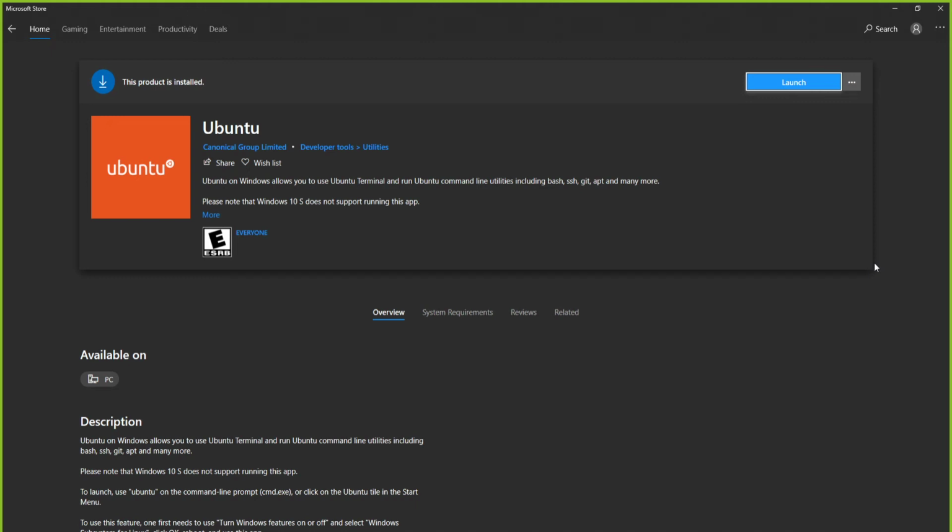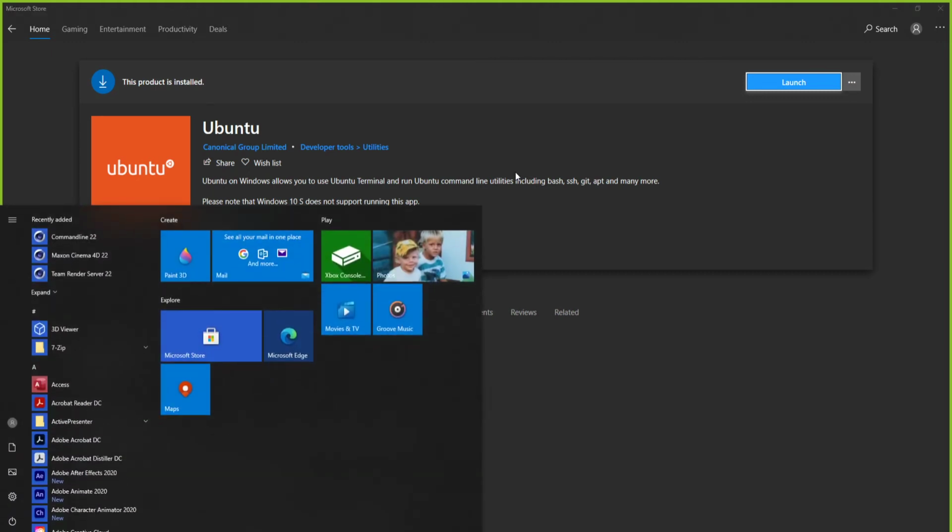It's interesting because I installed the Ubuntu, the 20.04 or something, and the only thing that I can find in my directories is the file that I made with Nano, and nothing else shows up. In your directories. Right.